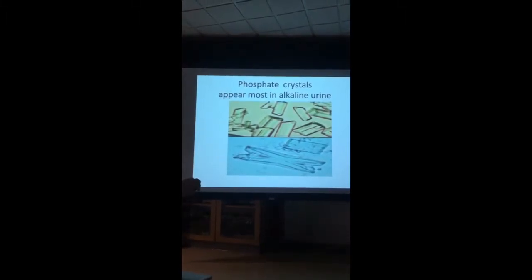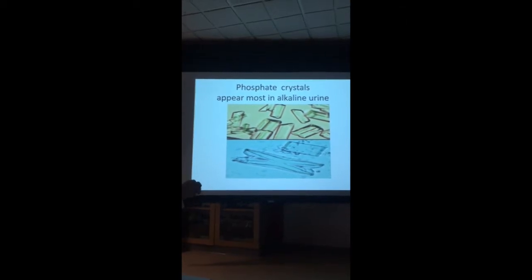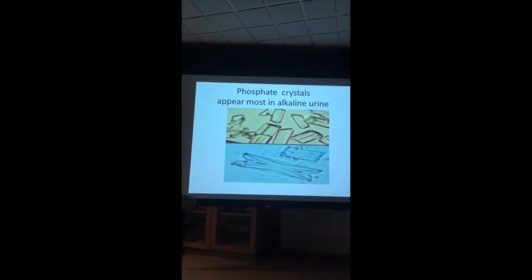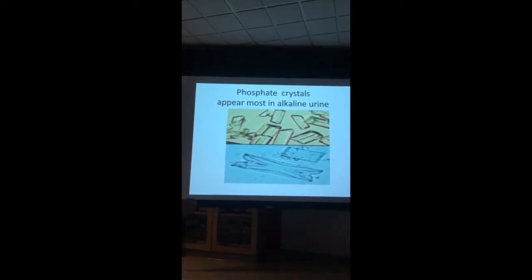These are phosphate crystals. These little things, one place used to call them coffin lids. I don't know, but anyway, go with that. This one looks like an X phosphate. I don't know, you're gonna come up with something to remember it next time though.